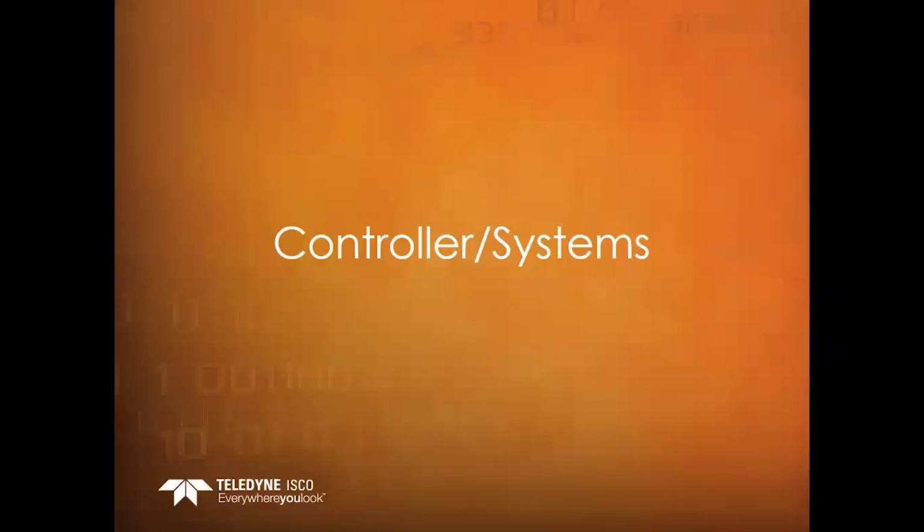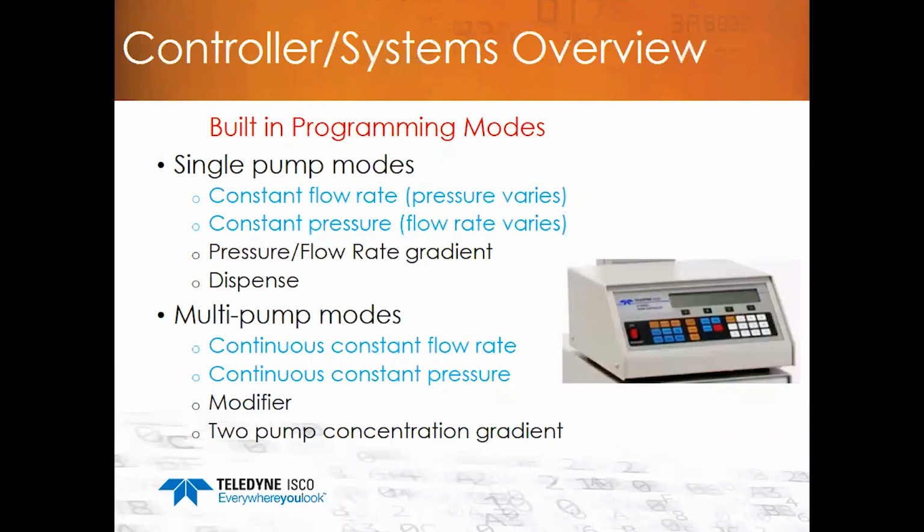Next, we'll talk about the controller and the pumping systems. The controller has many built-in pumping modes. However, we're just going to discuss the 4 below in blue. On the single pump mode, you have the constant flow rate. This is where the flow rate is set, but the pressure will vary. Or constant pressure. This is where the pressure is set, but the flow rate will vary as needed to maintain the pressure even if the pump must back up.